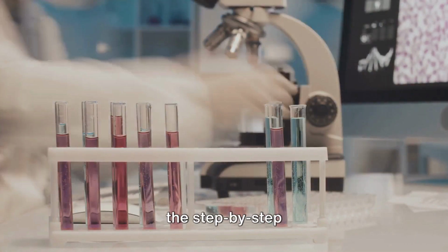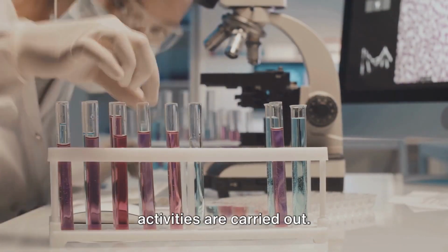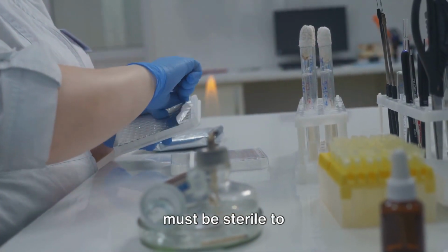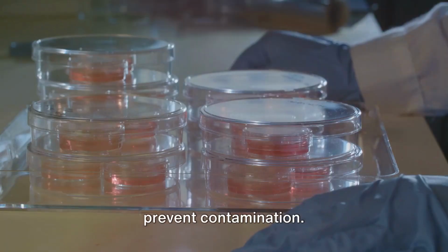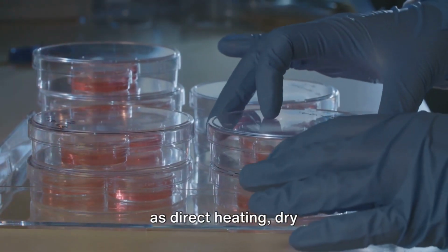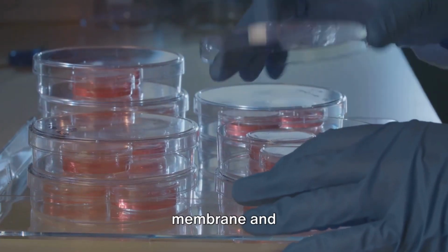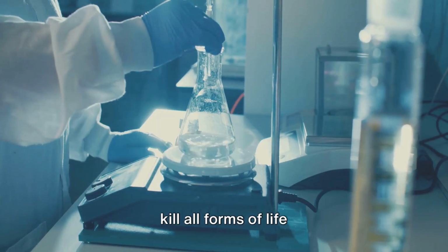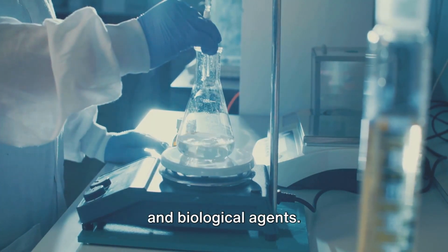Now let's dive into the step-by-step process of how these activities are carried out. First, all consumables must be sterile to prevent contamination. This is achieved through various methods of sterilization, such as direct heating, dry sterilization, filter membrane, and autoclaving, which uses high-pressure steam to kill all forms of life and biological agents.